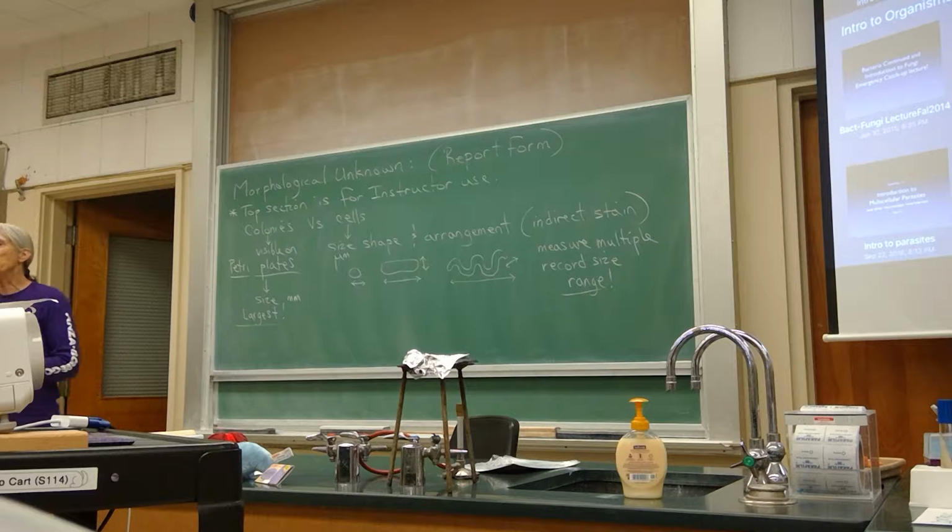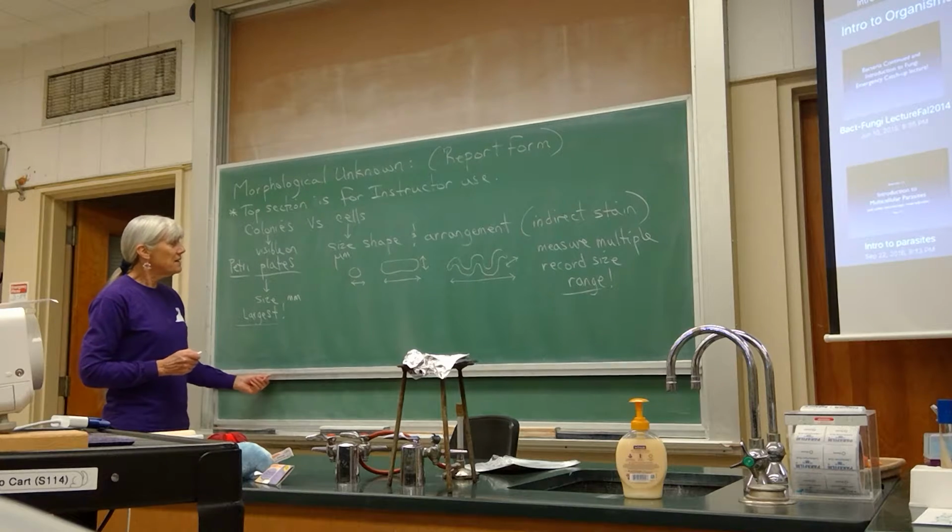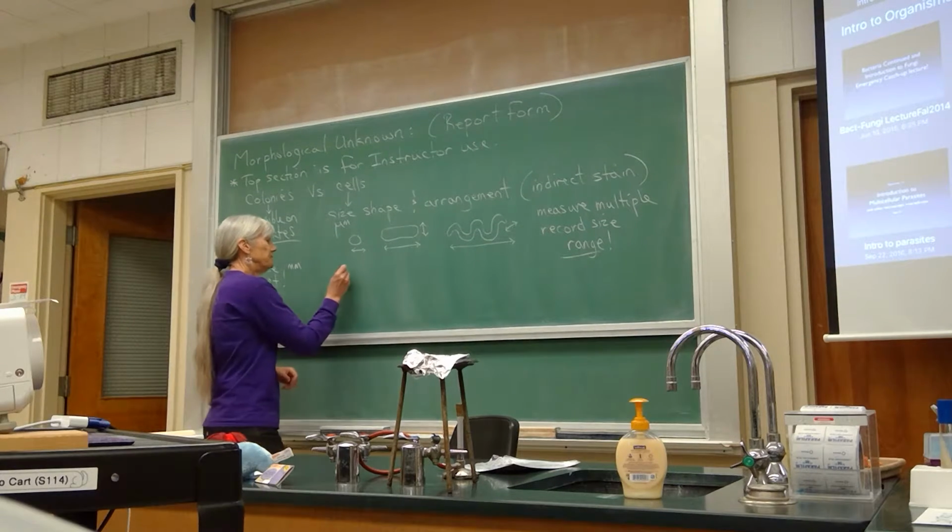The only problem we run into is the smallest unit that you actually have to measure is 1 micron. And very often the cells are a little bigger than that or a little smaller than that. So you have to estimate, say, well, it's 1.1 or 1.2, or it's 0.8 or 0.9. Anyway, so that's cell size. And then you have the stains.